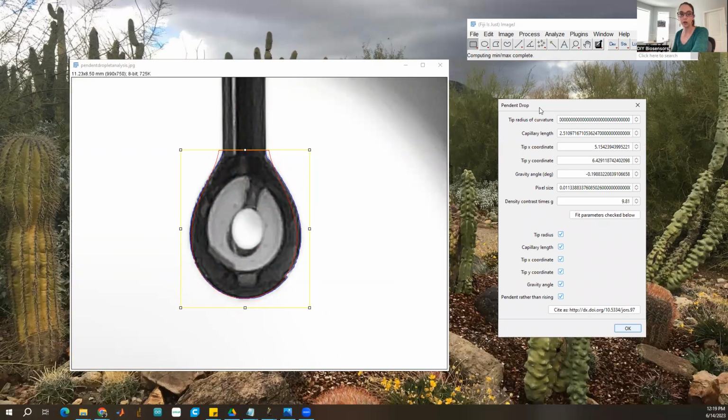and getting you started, but you definitely want to make sure the fit is better. As you can see here, we've got some empty space and here it cuts in too wide. So typically the first thing that you can do is get your X and Y coordinates correct. This corresponds to the tip point down here. This looks pretty good, but it's too far to the left. So I'm just going to shift it over. That looks good.